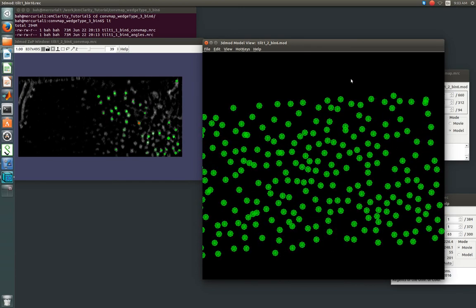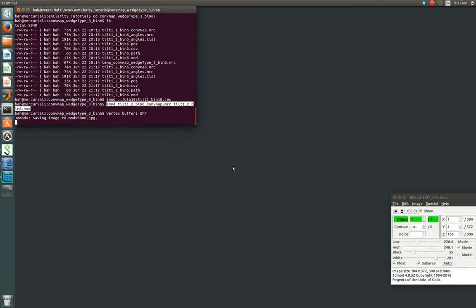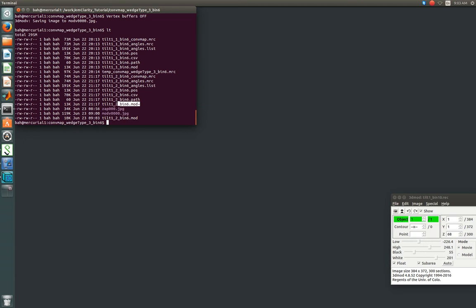Once you've done all this, you just close the iMod dialog, and of course you want to save the model. This time we don't need to name it, it'll just save a backup copy. So you see this, tilt 1, 2, bin 6, mod, with the tilde, that's the backup. And then this is our new model file. So when you've gone the whole way through, you might create a directory that's just original mods or something, and move all these backup files, or you can just leave them there as backed up.